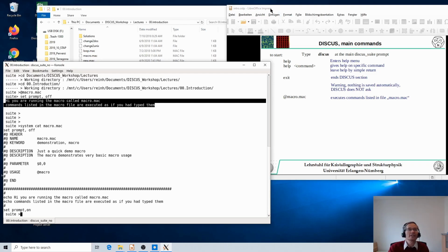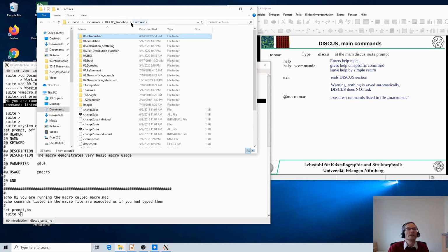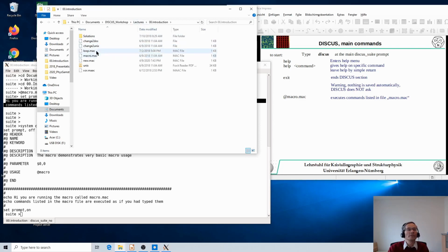Actually, in this folder lectures, you will find plenty of different subfolders which all contain many of these macro files with templates that you can use and expand upon.